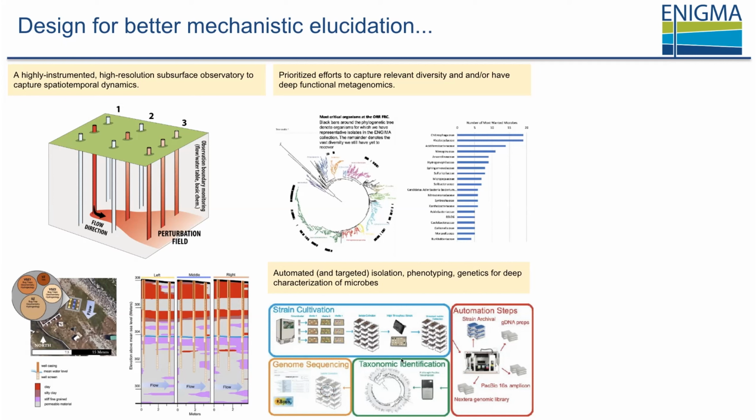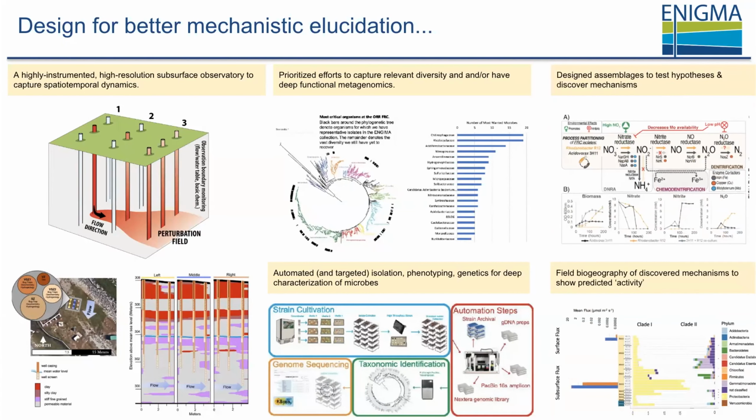And so this requires a fair number of data integration steps and analytical steps that link the data one to the other in reasonable ways. Once we have an idea of the most important microbes and how they operate, we have a characterization pipeline that measures their growth under hundreds of conditions. It measures their exometabolomics under a series of very well-chosen conditions. We sequence their genomes, and in some cases we can do genetics on those to figure out how each gene confers fitness in those environments.